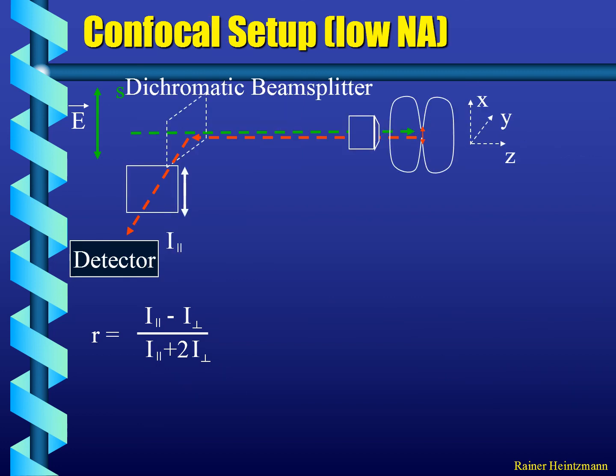So what about this factor of 2? If you think about this, you're typically doing this in a microscope. You're exciting your dyes like this, but then you're detecting light only in the reverse epi direction here, and we cannot put an objective sideways or something like this.